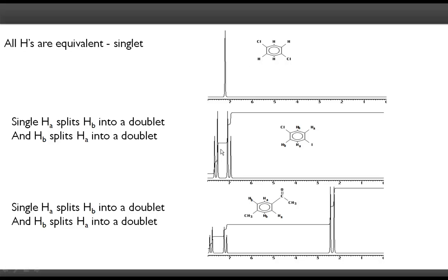so you get only one singlet and it doesn't split. The moment you differentiate one of the halogens as iodine, so this is different than that, it's in turn different than this one. So you have two here, so there's only one plane of symmetry here, I guess. So you get two peaks, but this hydrogen is splitting the other peak, so you get a doublet for this hydrogen and you get a doublet for this hydrogen, and that's shown here. Okay.